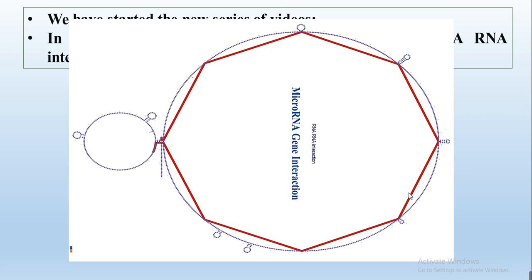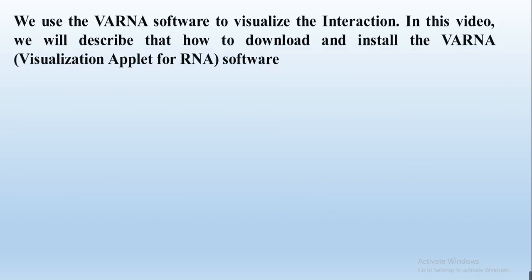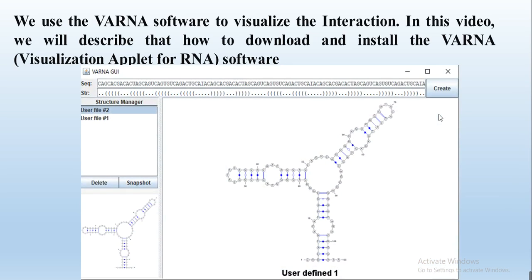How can we get this type of figure or this type of analysis? It will be done with the help of VARNA software to visualize the interaction. In this video, we will describe how to download and install the VARNA software, and this is the logo or software screen in which it shows the results.